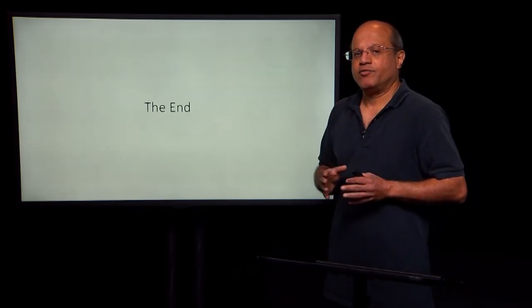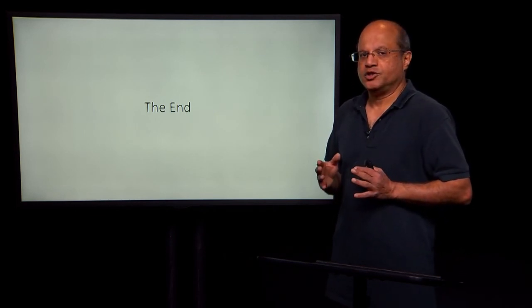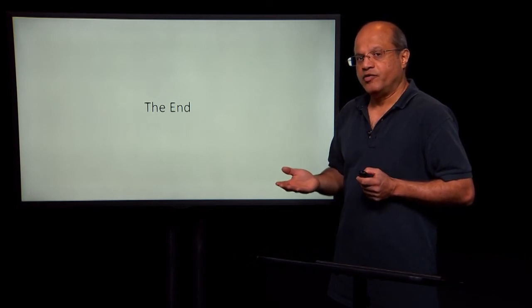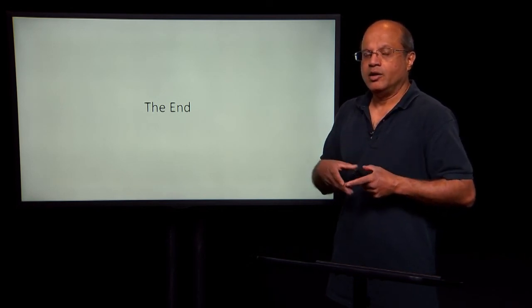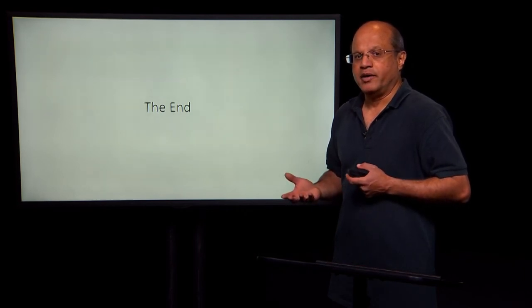Okay, that's all I have for this lecture. Now that we have all of the stuff in place to actually describe the formation of an image starting from a particle, we can then work our way towards actually developing algorithms for particle reconstruction.